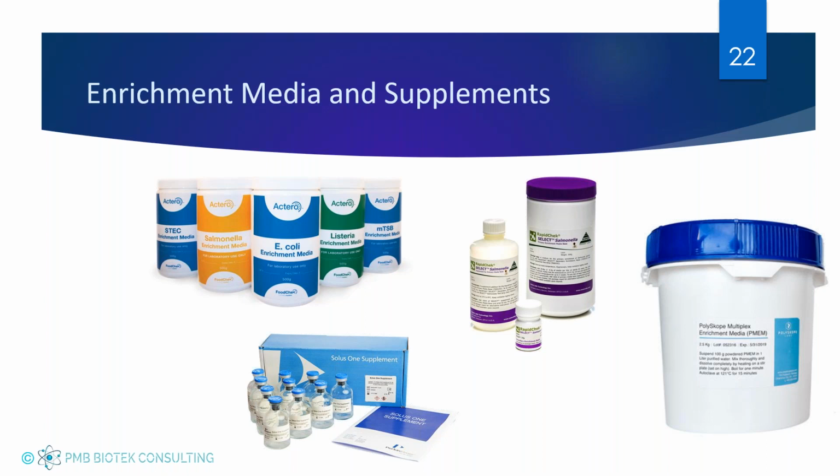a significant amount of media. It's up to like a liter. Well, the cost to do that is very expensive. So this supplement can bring it down to 1 gram into say 100 milliliters or 10 milliliters. So companies are starting to invest in these sorts of techniques.